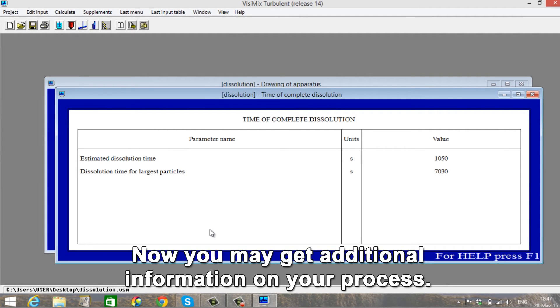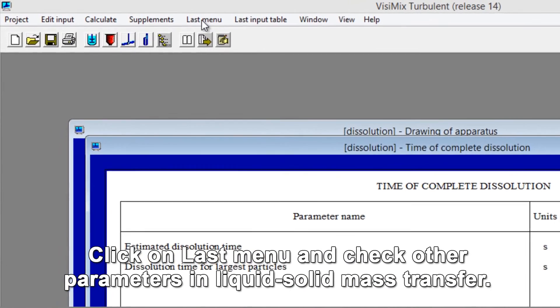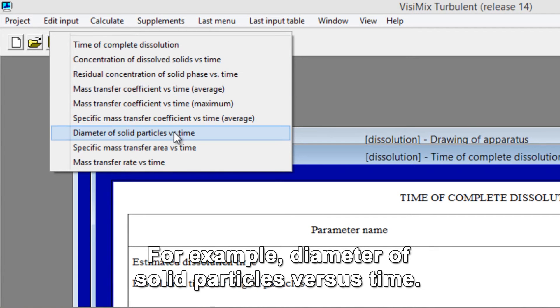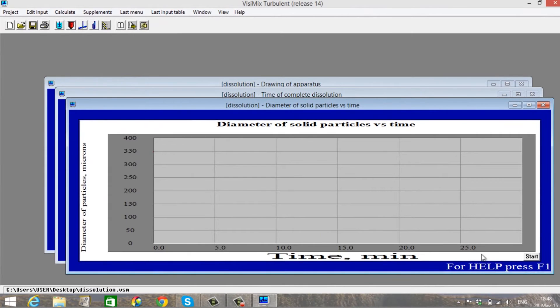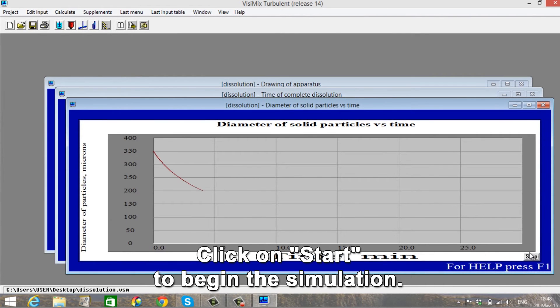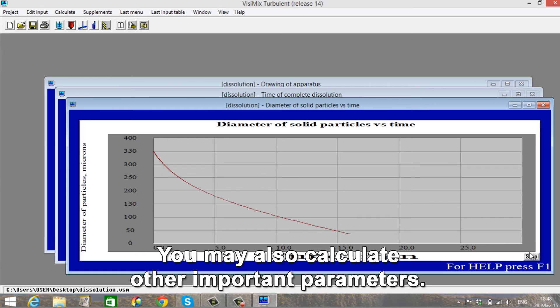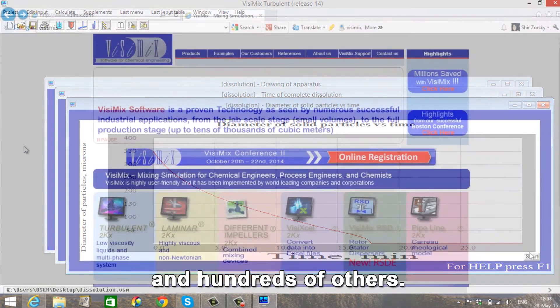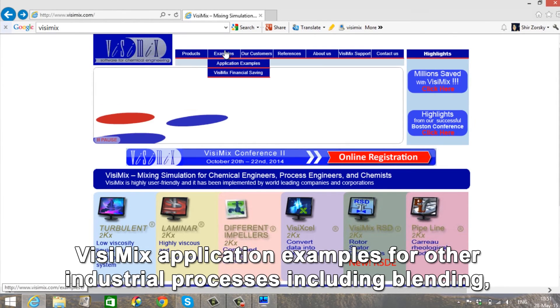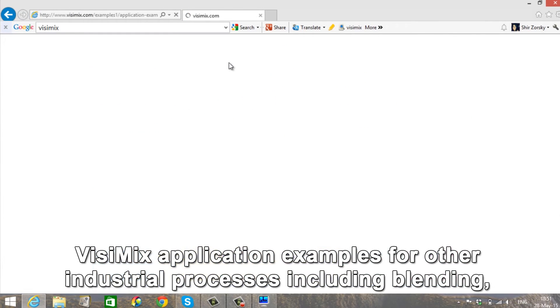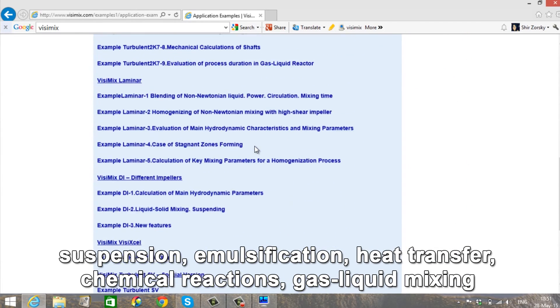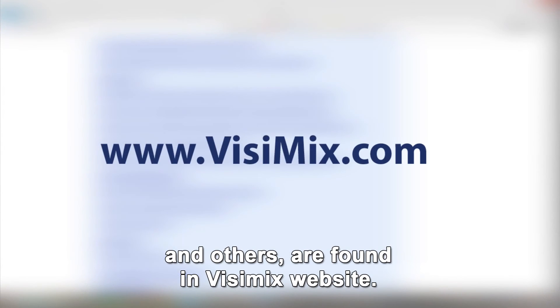You have thus improved your design to ensure complete suspension and calculated the dissolution time in your tank. The change in the impeller tip diameter and number of blades proved to be favorable to your process. Now you may get additional information on your process. Click on the last menu and check other parameters in liquid-solid mass transfer, for example diameter of solid particle versus time. Click Start to begin the simulation. You may also calculate other important parameters, for example mixing power, macro mixing time, shaft vibration and hundreds of others. Vizimix application examples for other industrial processes including blending, suspension, emulsification, heat transfer, chemical reactions, gas-liquid mixing and others are found on the Vizimix website.